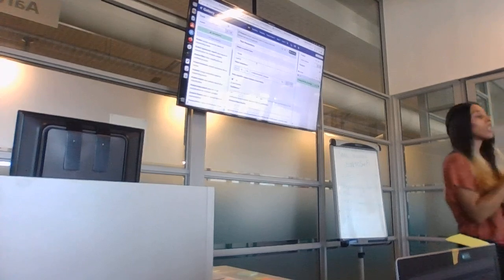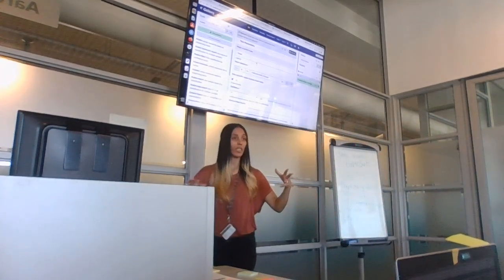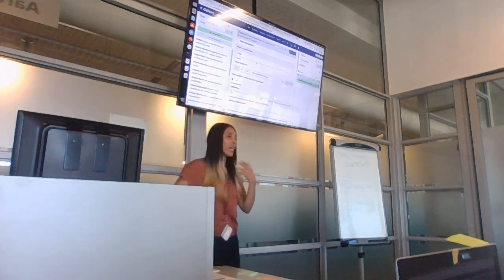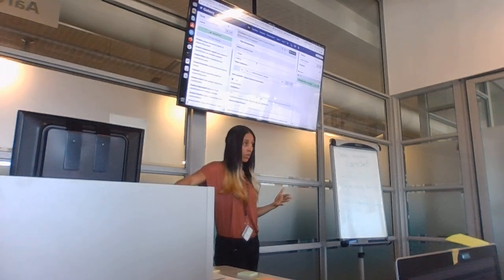The forward. Okay. Let me answer that generally because 4 people have asked it now. It doesn't matter if you take the forward or the reverse, and even if you do both. That is a sample that was contaminated, which means its forward and its reverse read will be contaminated.